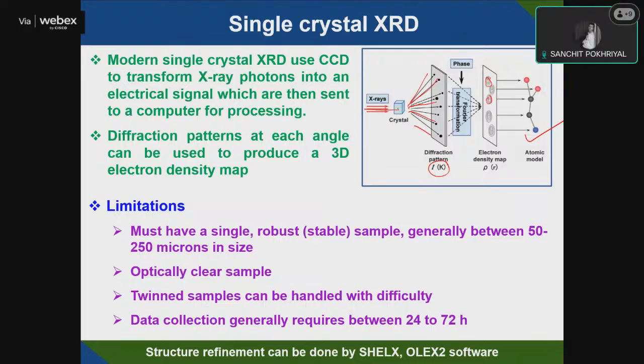But sir, why cannot it be done after the experiment? Because we already have all the data collected. We only need the data. Yeah, that is correct. But see, once passing through the detector, you will get some spots, and once you transform, there may be some losses. So it is better to have inbuilt software with the instrument.